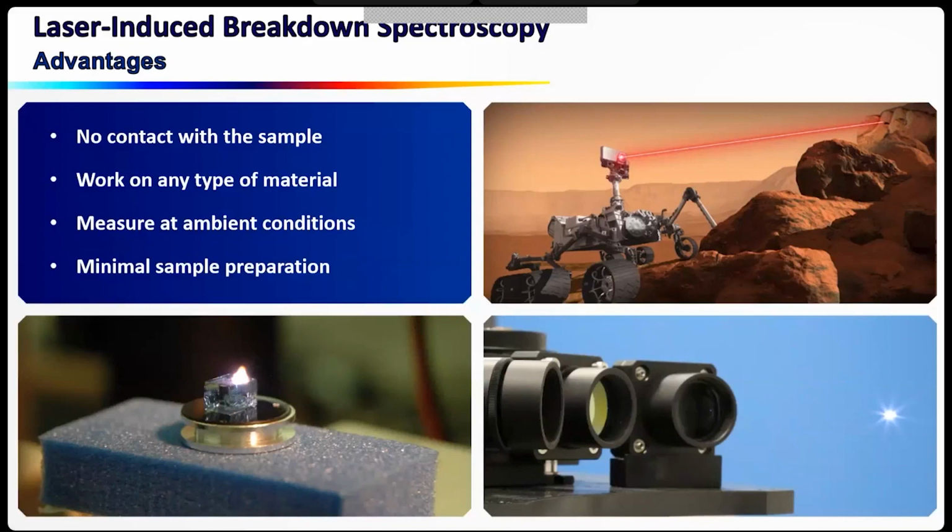This works with any type of material. Of course, it's better with solids, but you can analyze liquids, even inside liquid. Some groups have developed LIBS instruments to go inside the oceans for archaeological findings on old ships and so on. It's working. But you can also analyze in the air, no problem.